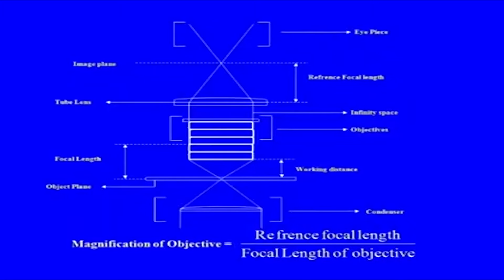So, most advanced microscopes now contain infinity corrected optics. In infinity corrected optics, you are able to insert auxiliary components like polarizers and prisms without any image problem. Now, how does it work?